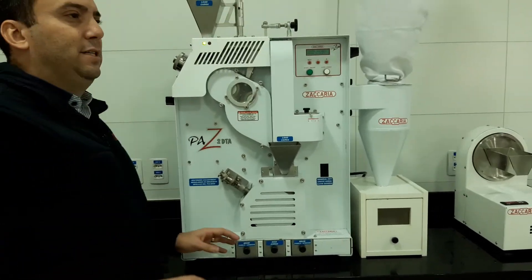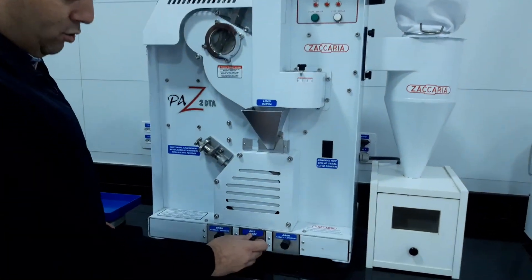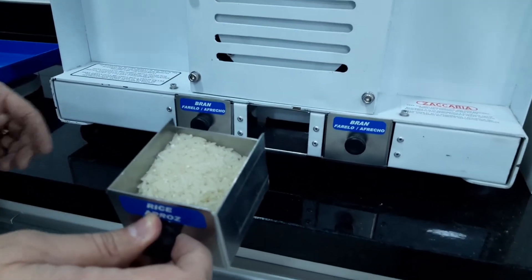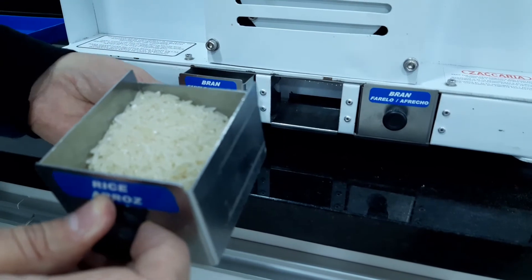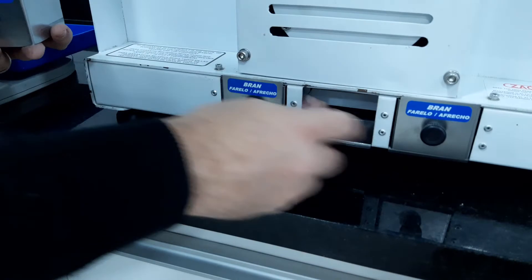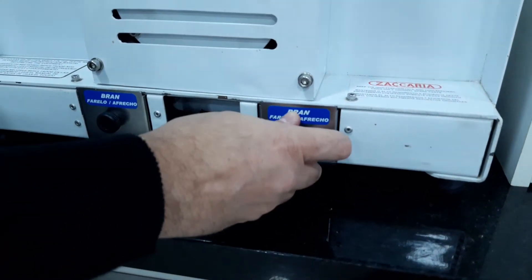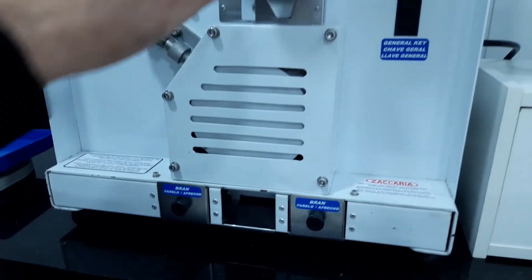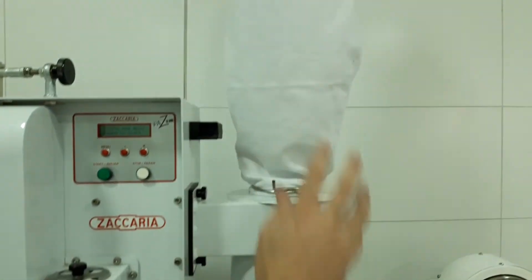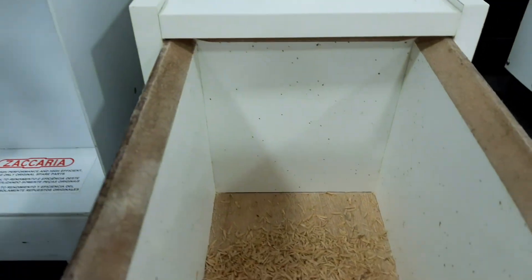So after 75 seconds the machine will stop by itself. From this compartment we will have the white rice, and from those compartments here we will have bran. All the husk and dust will be aspirated by the cyclone filter and collected inside here.